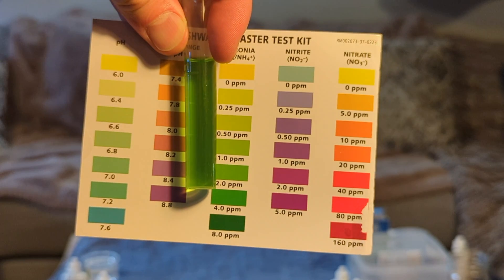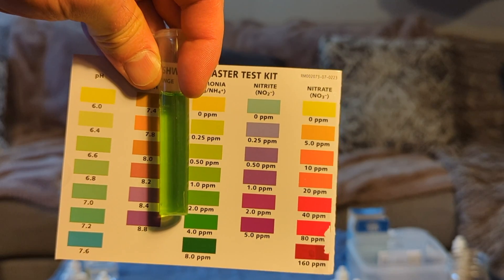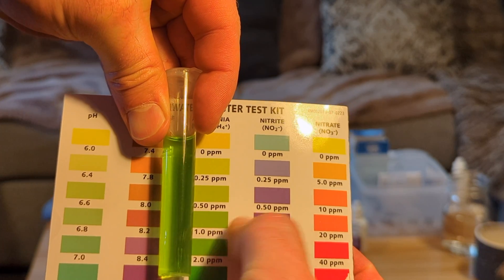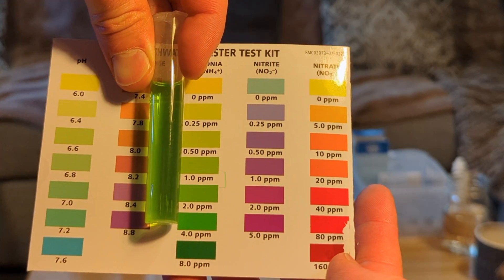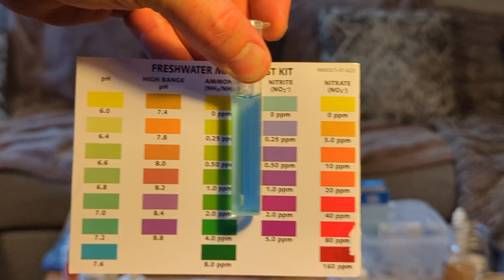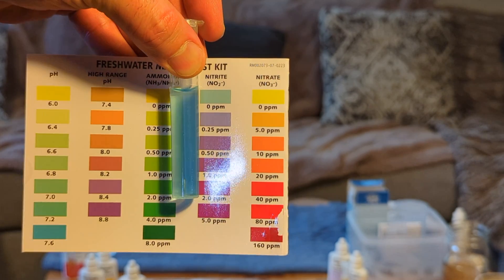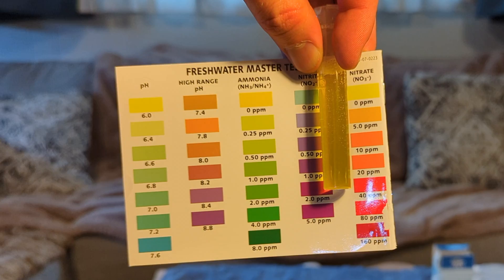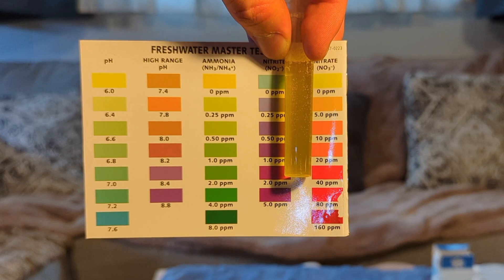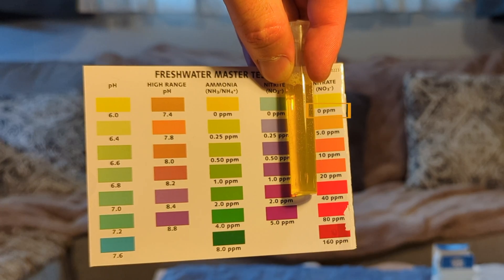It's been five minutes and the ammonia is done. All you've got to do is hold it next to the chart and compare the colors. If it's not that exact color, look in between. I'd say this one is in between one and two parts per million. For the nitrites, there are absolutely no nitrites — it should have a little bit of purple, but it's completely blue, so that's a good sign. And for the nitrates, it's not completely yellow but it's also not really orange either — somewhere in between zero and five parts per million, maybe two.